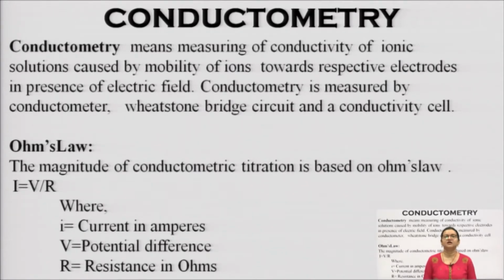So, according to this relationship, the principle behind conductivity is that the concentration, mobility, or conduction of charged ions, or charged analyte particles, is directly related to the voltage generated and the current generated. Okay. We will use this principle to ascertain and measure the concentrations of a given analytical solution.